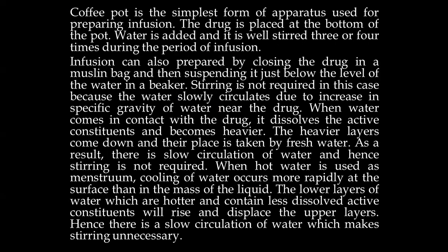The coffee pot is the simplest form of apparatus used for the preparation of infusion. In this method, the raw material is placed at the bottom of the pot. Then the solvent, whether water, cold water or hot water, or a selective solvent, whatever it is, you can pour and wait for the stated period of time. During this period, occasional stirring is required so that the saturated layer is disturbed and the fresh menstruum comes in contact with the drug, so that we get a perfect extraction.